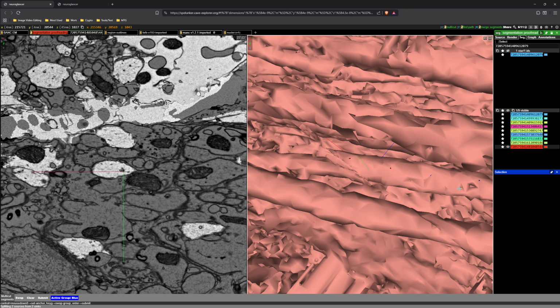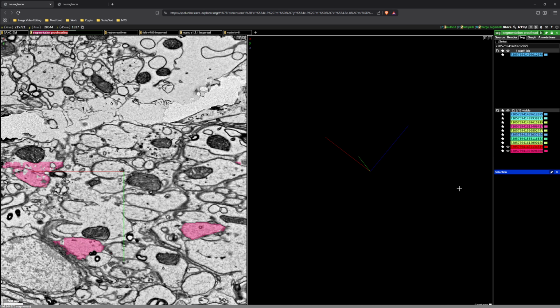Feel free to watch this part at 2 times speed as we wait for the cut to happen. All right, the cut was made.